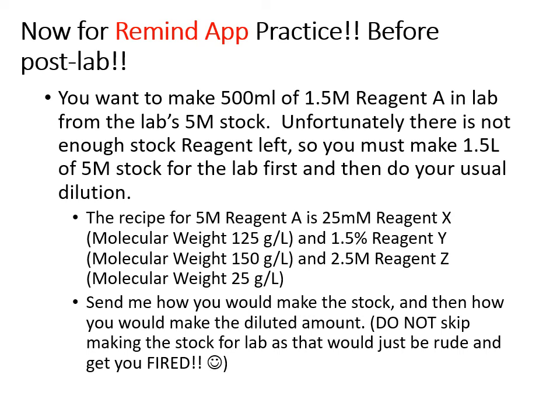If you just send me making reagent A, the 1.5 molar from the recipe and not from a stock, then I will fire you from the lab that we are working in. Okay, so please write out this problem. You can write out the question, or you can send a picture of the question and then write out how you would solve it. If you're worried about the final answers for some of it, you don't have to solve for the final answers. You can just show me how you would fill everything into the formulas.